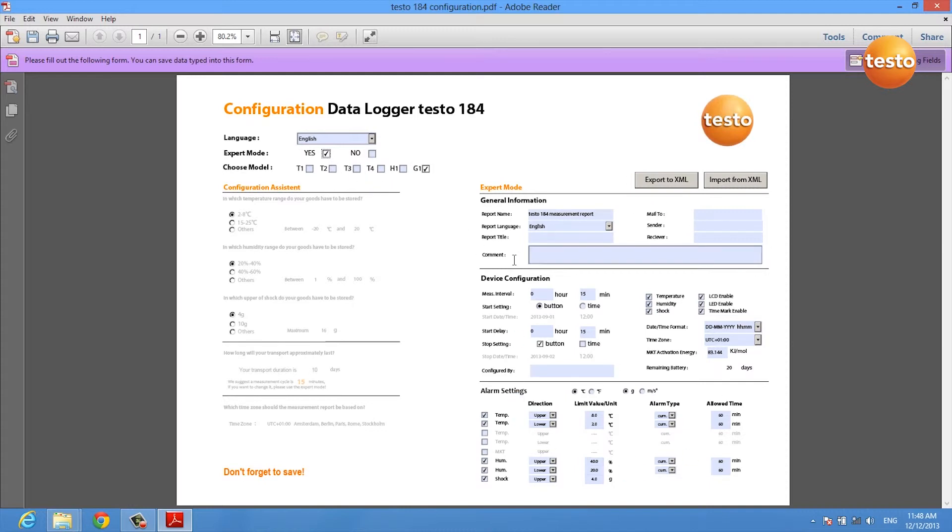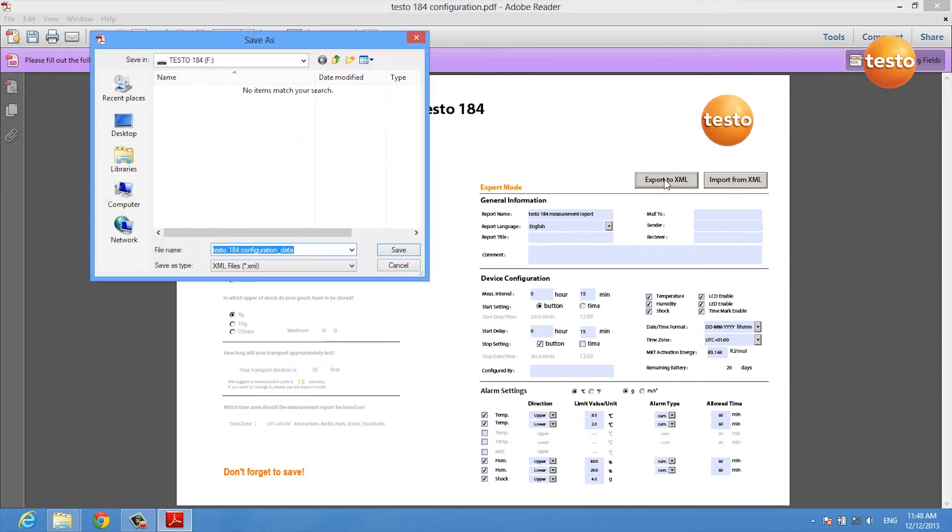After you've done all the configuration in here, you export the configuration to an XML file which you save on the data logger itself.